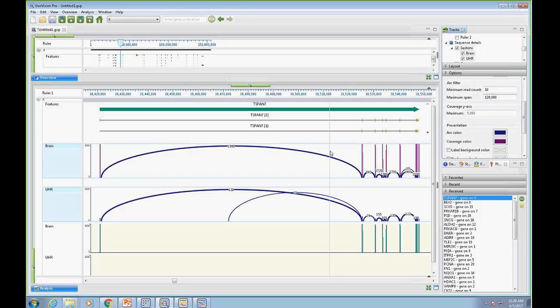I had already changed it to a fairly big number of 120,000, and that's to support this particular exon you can see here that is about a 100,000 span between exon 1 and 2 for this particular gene. There are some genes that have an even greater span. If I make the arc length too big, there may be some spurious pseudogenes in the neighborhood, with reads that split between gene and pseudogene. So we can filter that out as well.